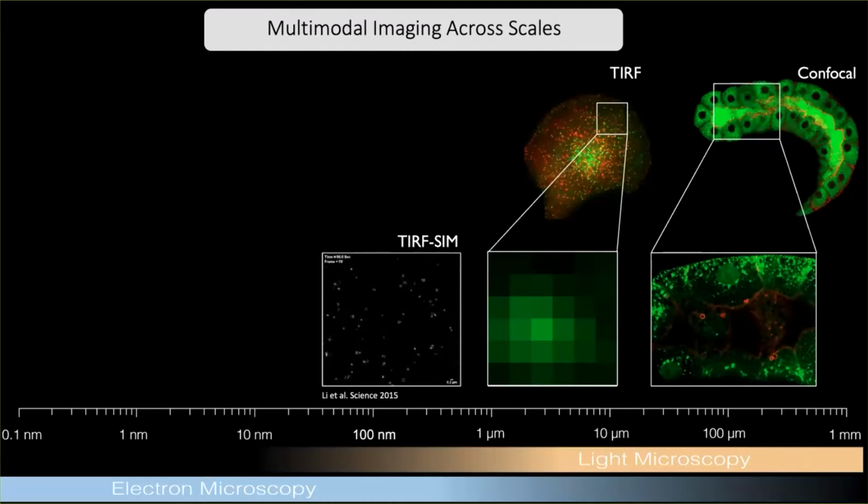Here is an example from a few years back. So still we are looking at a two-dimensional image, but now if you look really closely, you can see the little hole. So now imagine that the vesicle is forming into the plane, and you're seeing the cavity of that membrane being formed. So some spatial resolution is there, but it's two-dimensional.